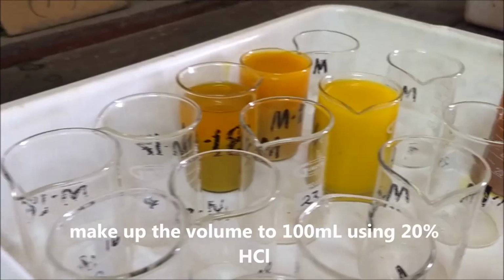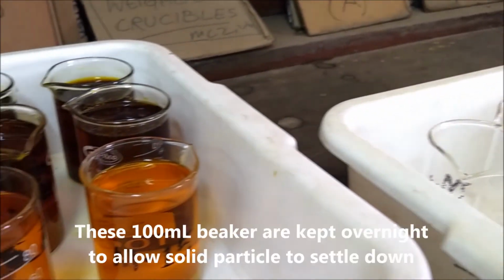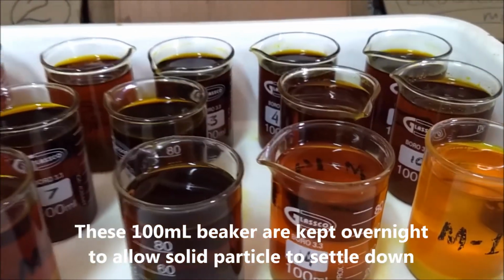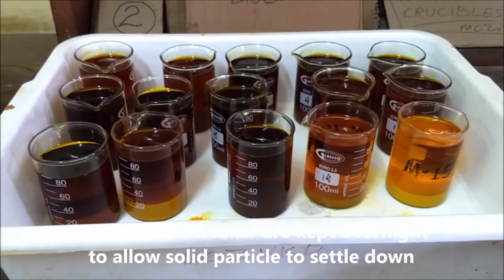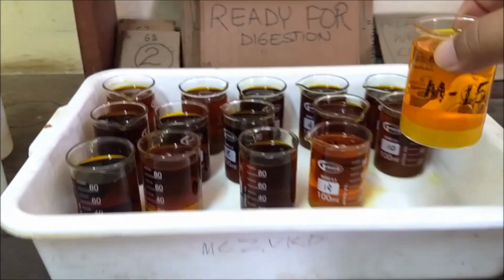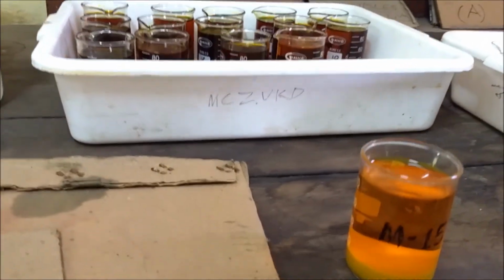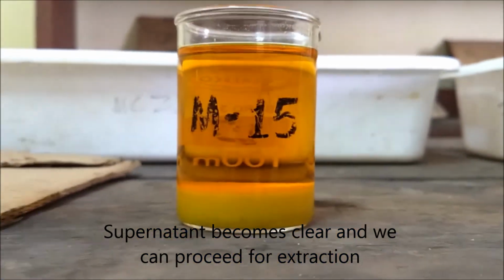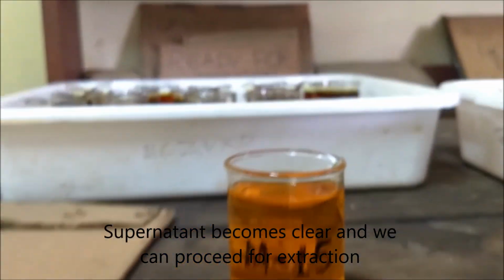We will allow the solid particles to settle down by keeping these beakers overnight. This is a batch of samples where this exercise has already been done. Here you observe that the supernatant part is clear and hence we can proceed for extraction.